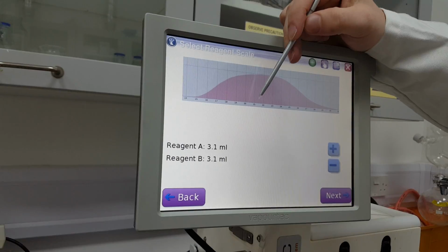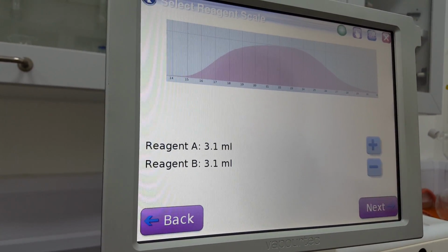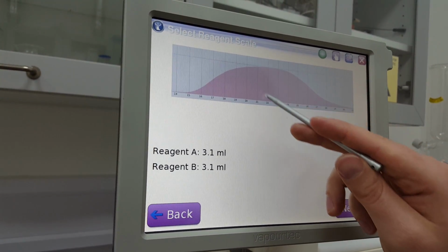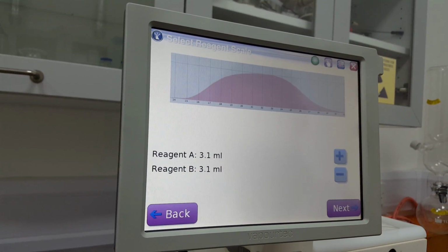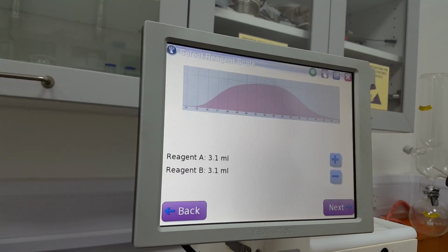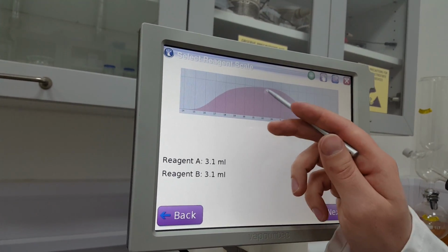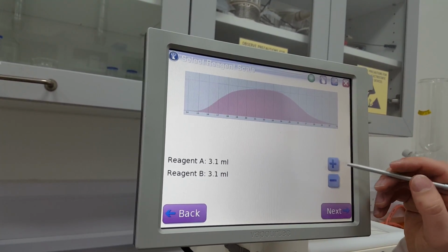So if you collect between 21 minutes and 23 minutes, you'll get the steady state that you want, or the concentration that you want. And these conditions that you've collected between those times will be representative of the flow at any scale. So if you then ran this for an hour, 2 hours, 3 hours, you're going to get the same result as you found here. Whereas if you collect all of it, it will be different because of course that steady state will change.